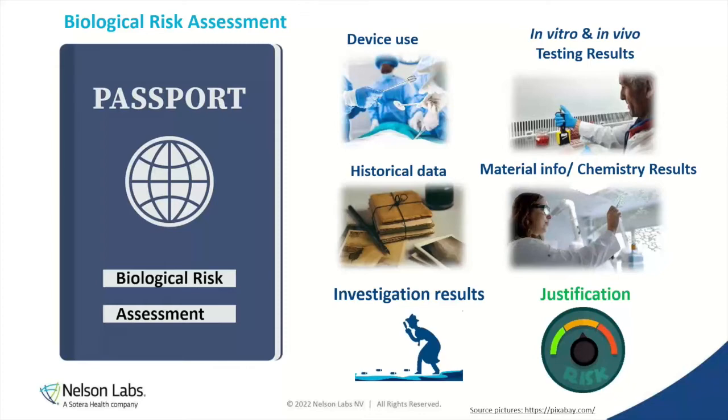And the investigation we did with hydrogen peroxide was that it was low enough concentrations to cause cytotoxicity failure, very low, so low that it almost didn't show in our chemistry testing, and the amount that we're getting off won't cause a risk to the patient because we're going to provide a lot of historical information on that as well. So that's our investigation, our justification, really tying everything together in a nice written document that fully supports patient safety based on these results.